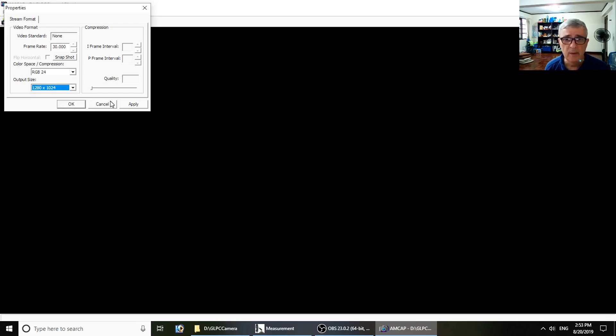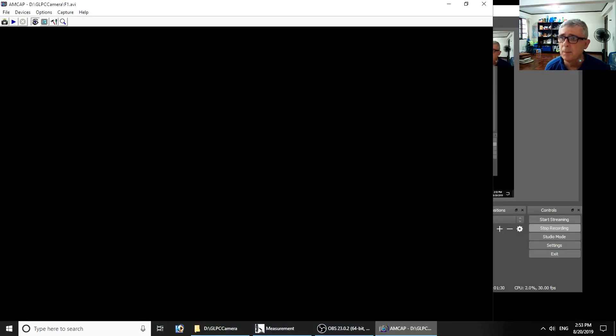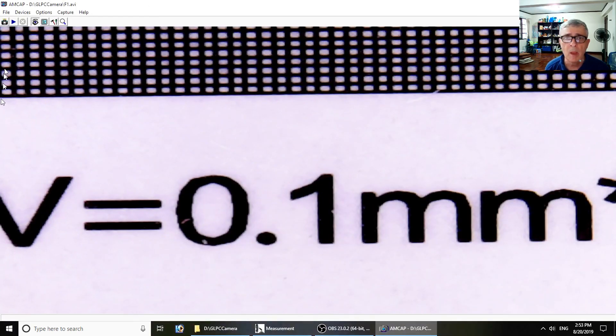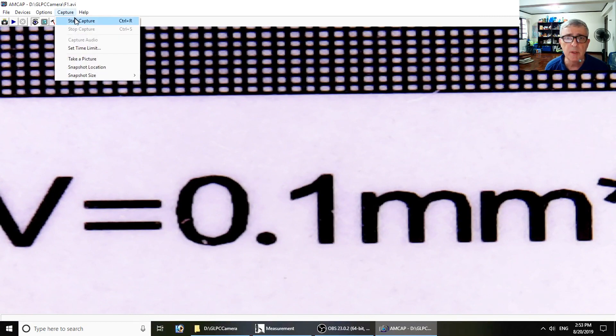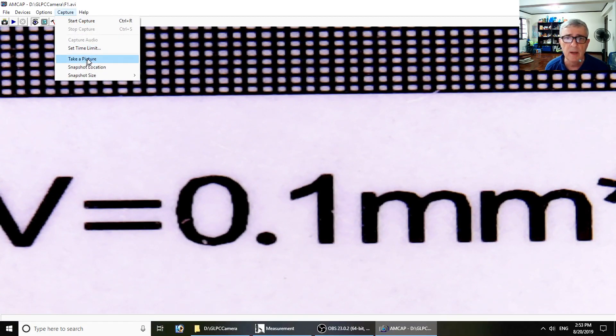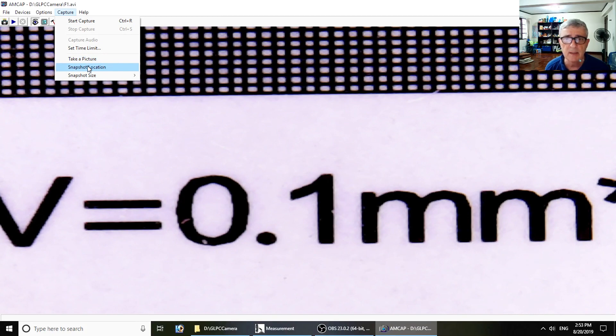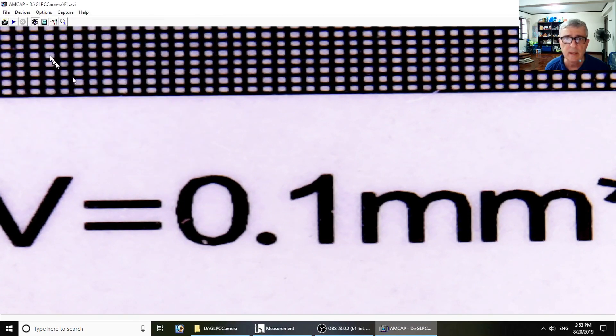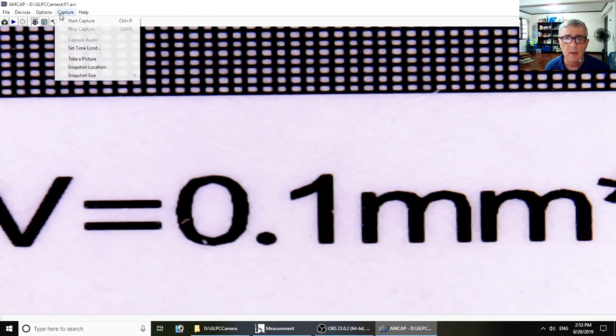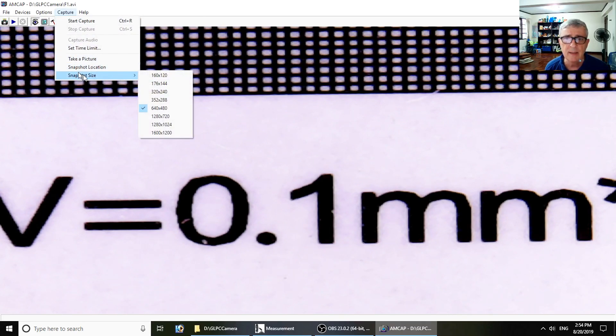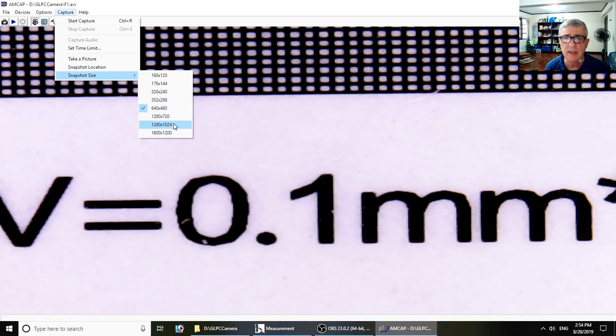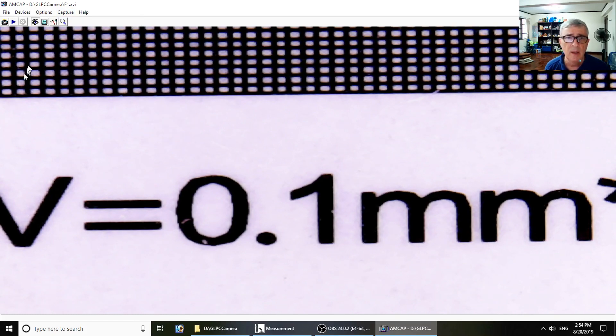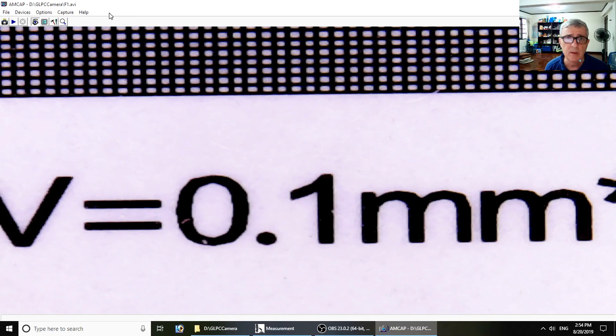Capture start capture, set time limit - that's for the video. Take a picture - that's a snapshot. Snapshot location - it does remember this, which is interesting. However, snapshot size it does not remember - you have to set that every time.